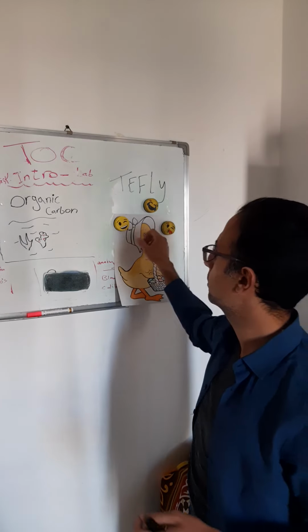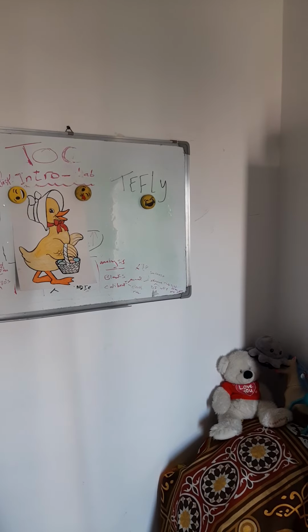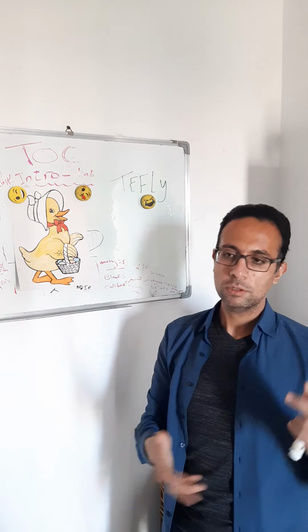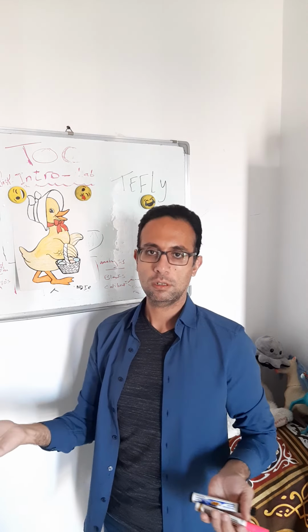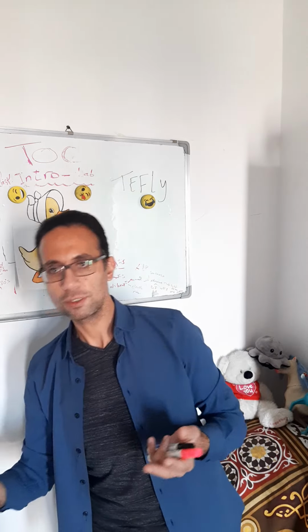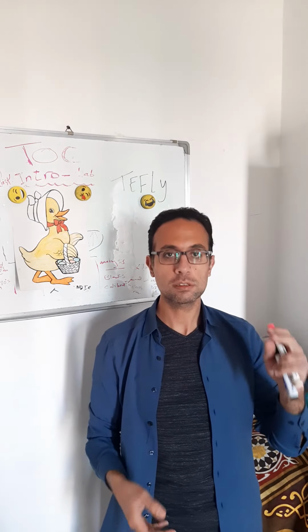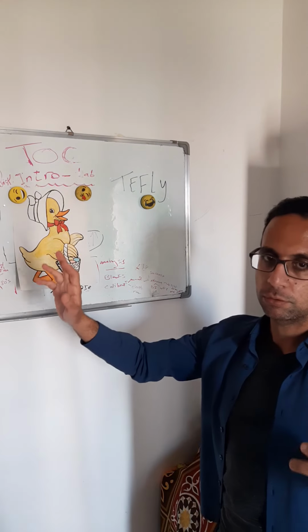We'll continue again. And of course, when we do any analysis in laboratories, environmental laboratories, pharmaceutical laboratories, water, industrial laboratories, analysis takes many forms.